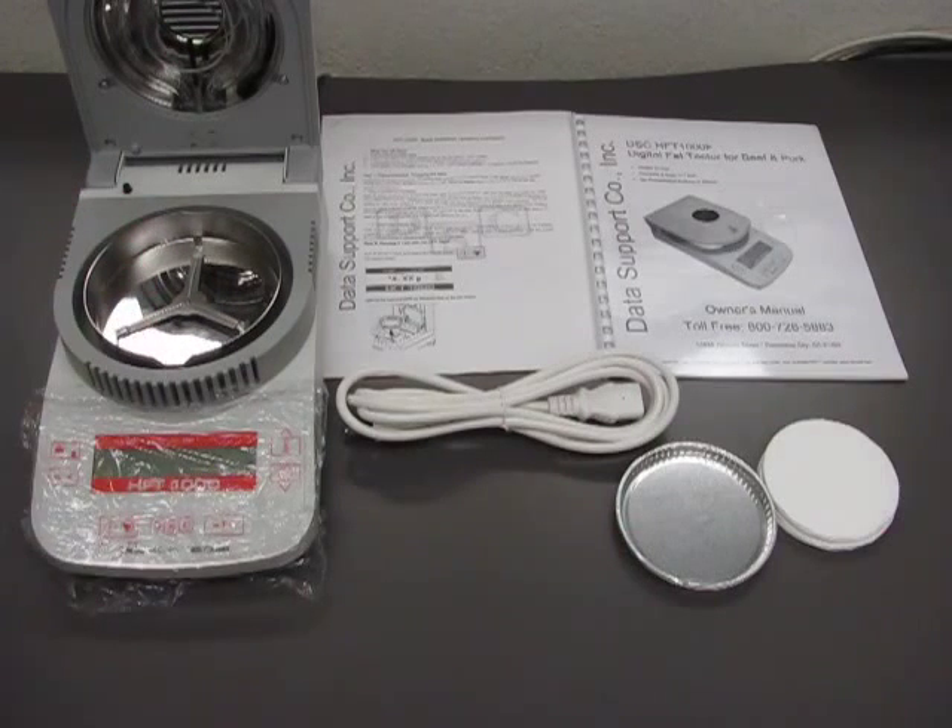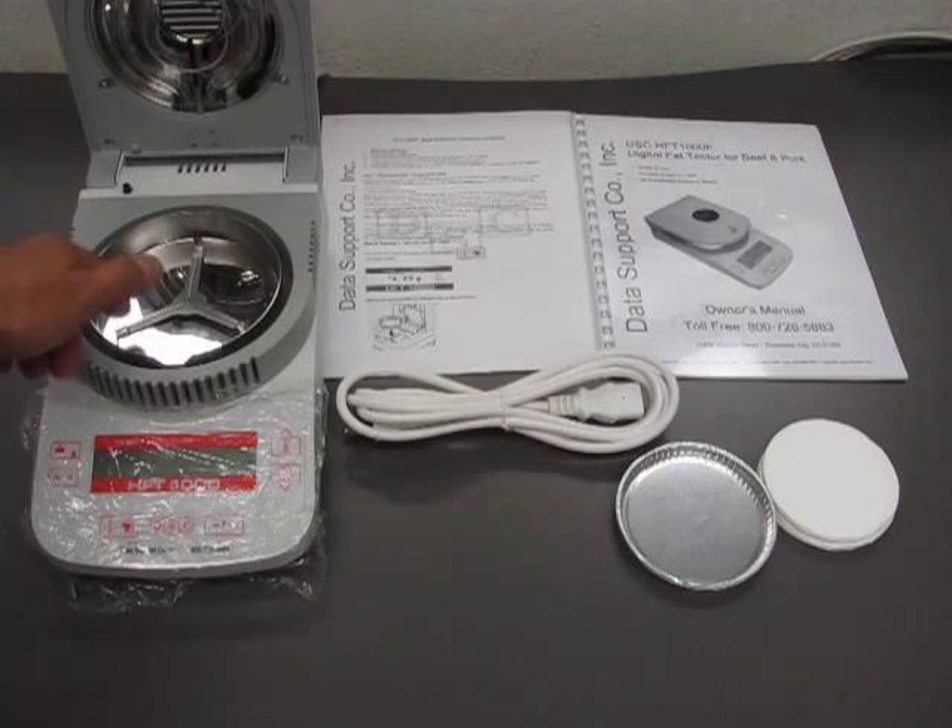Once the pan support is settled all the way in, it should not be spinning around.